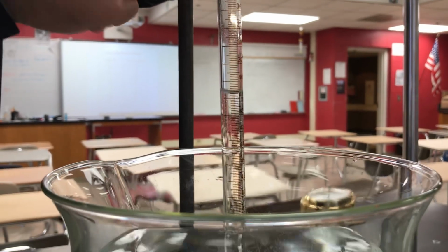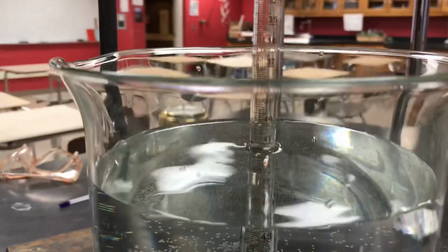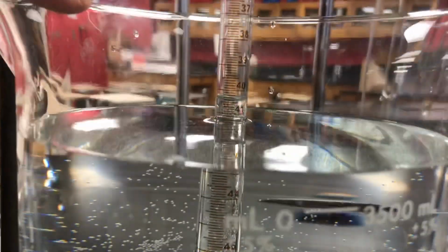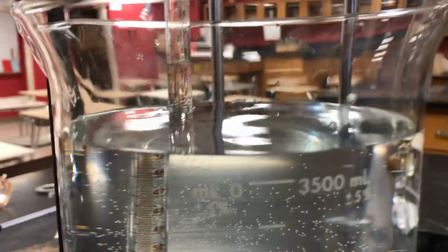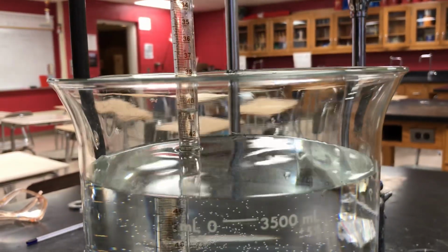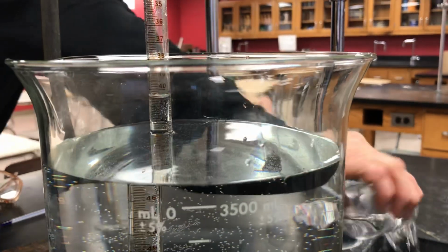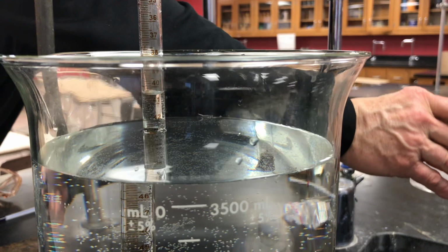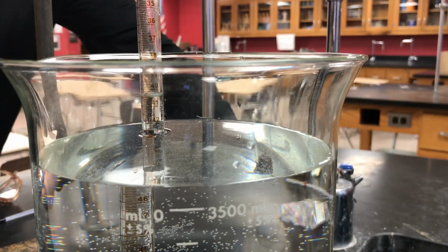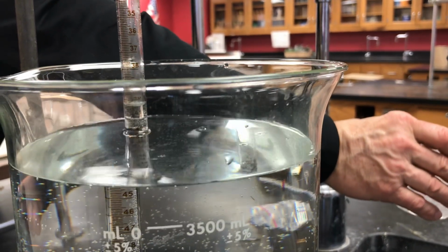and we're hoping we can adjust. We need to see the graduations. Now, you know what? I'm going to add a little more water to the beaker. I can't get the eudiometer down there far enough. So hold on a second. I don't know if this is going to take too long with this little beaker.